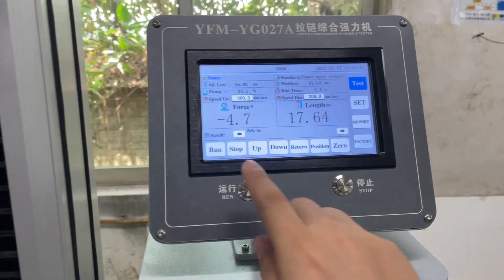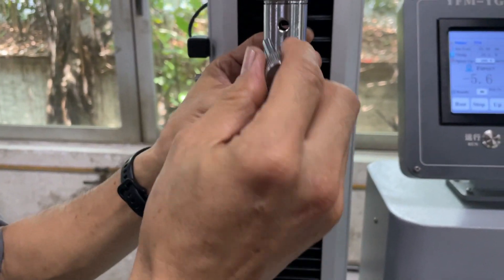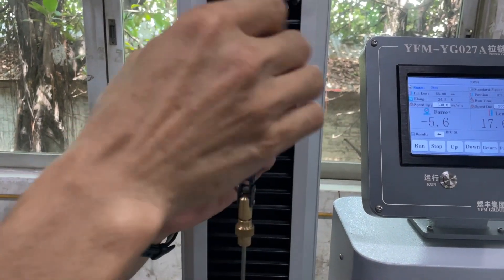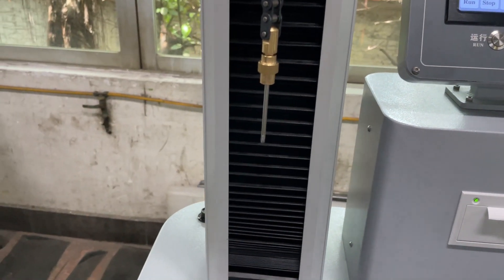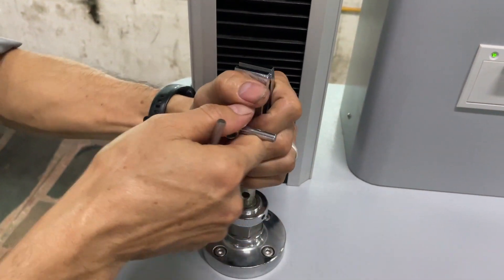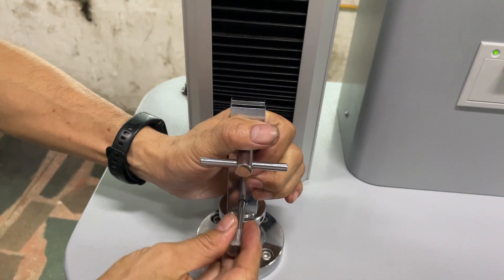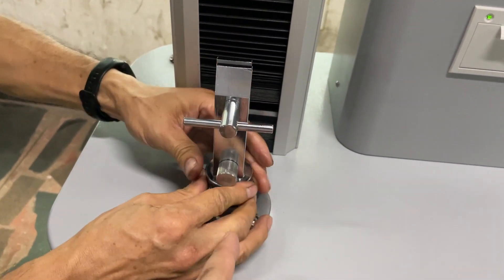Once the height is okay, we need to stop and install the fixture with the hook. Install the clip fixture and tighten the nuts.